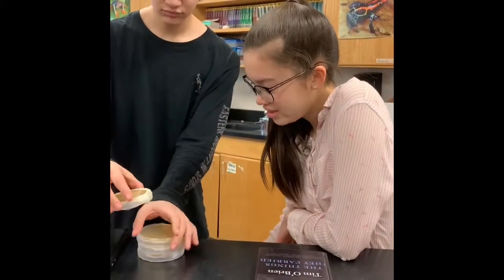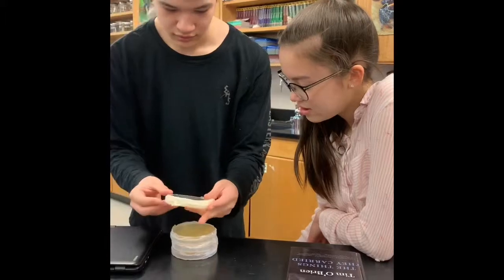Wrap the plate cover to the plate with tape and place the plates agar side up in the incubator.